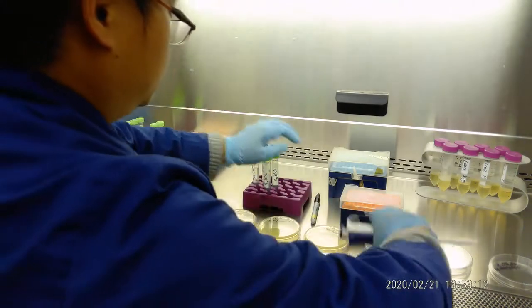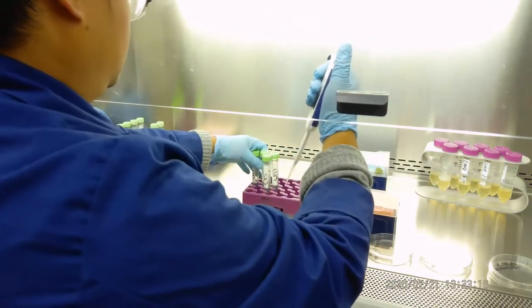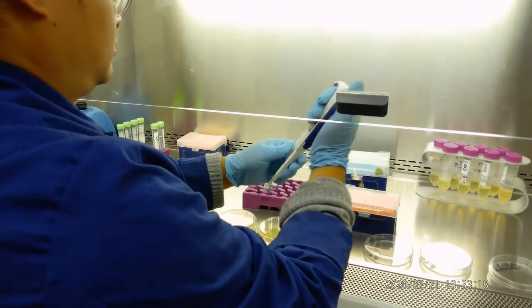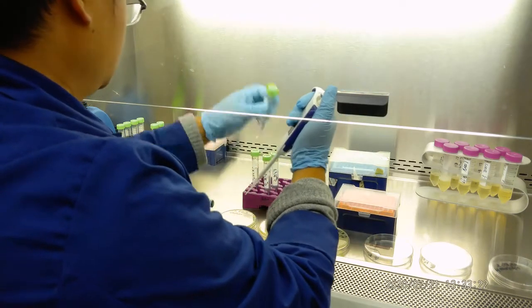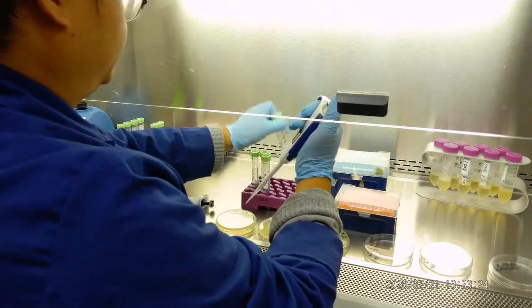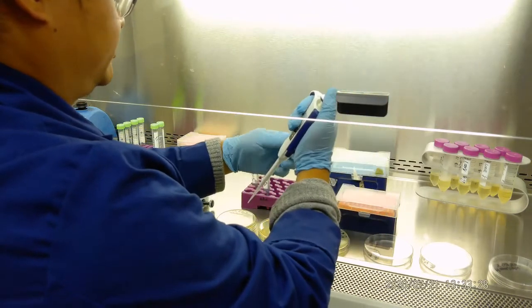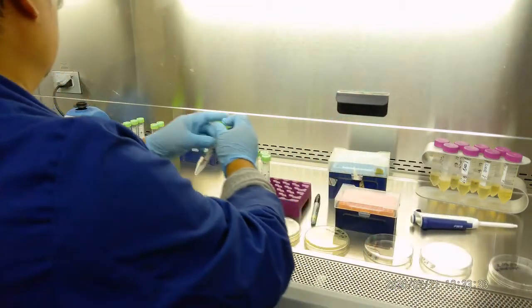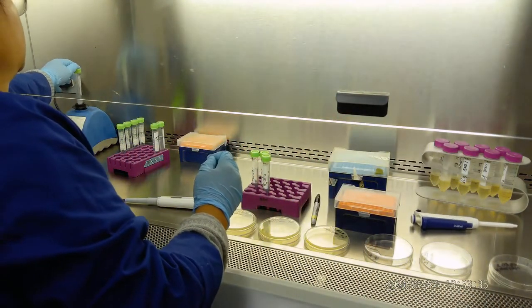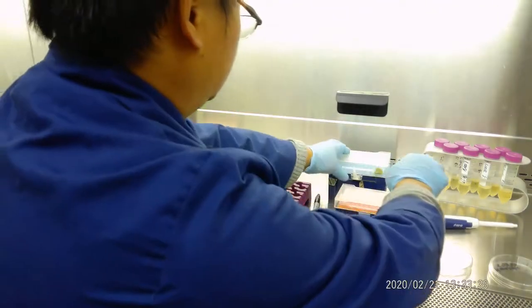And now the third one. We need a spreader. Go to the last one. So we shake it, and then we vortex it. Okay? Now don't forget that one. That one is 10 to the 5.